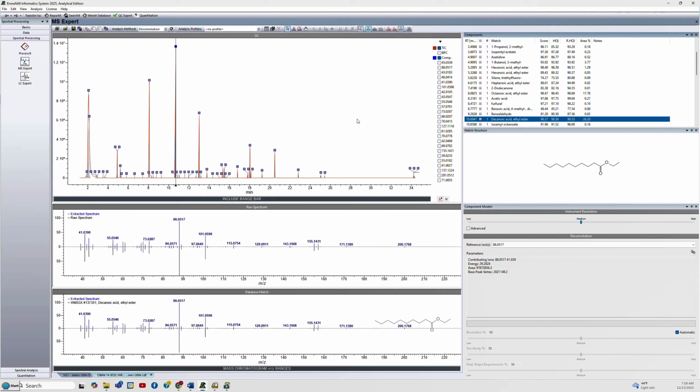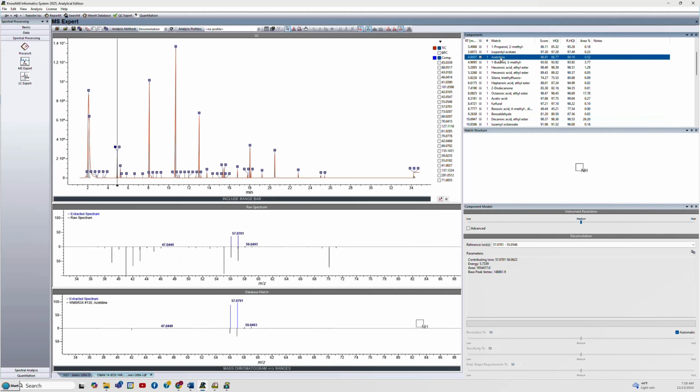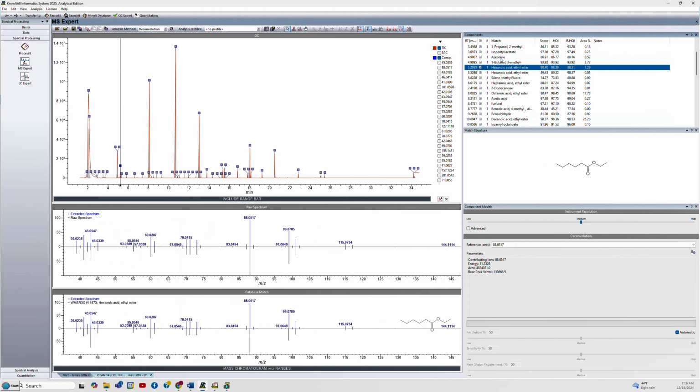There's one thing I forgot to mention when I was going through this process in the video: you can always change a lot of things in the final report. Let's say you're stepping through here and you decided that you didn't like that identity, you can press plus to open it up or use your right key on your keypad to show the other possibilities.